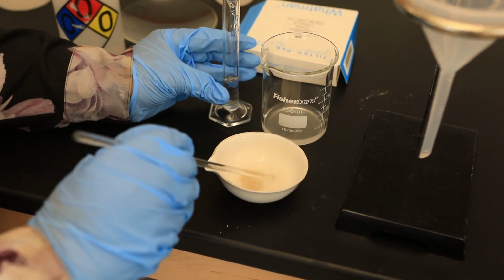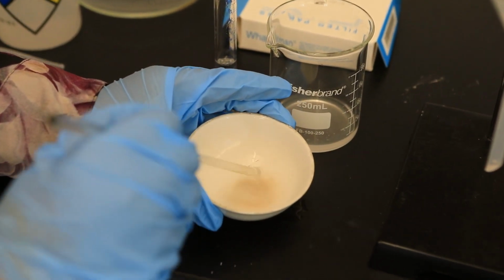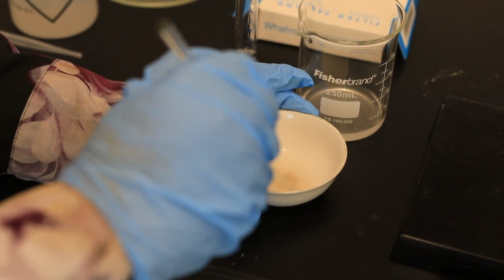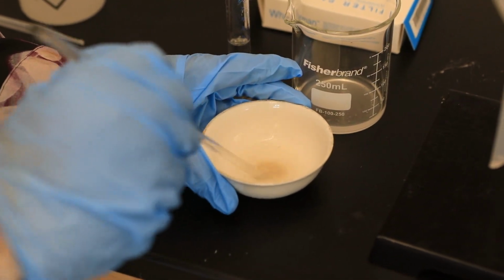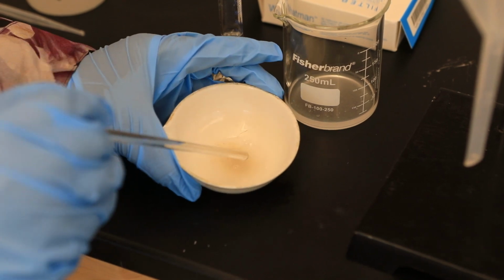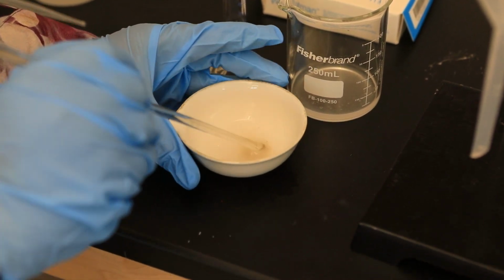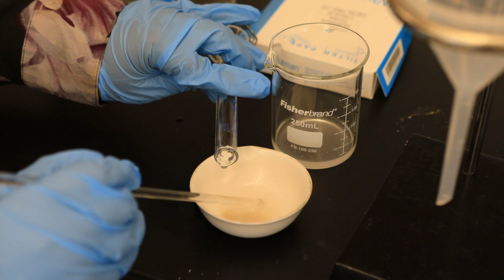Now, when the reaction is almost complete, what do you notice? You will note that you no longer see the evolution of that gas. So I'm going to keep on adding with stirring to make sure that I have converted all of the calcium carbonate to calcium chloride. Notice that that sand is pretty inert. That sand is not reacting with HCl.